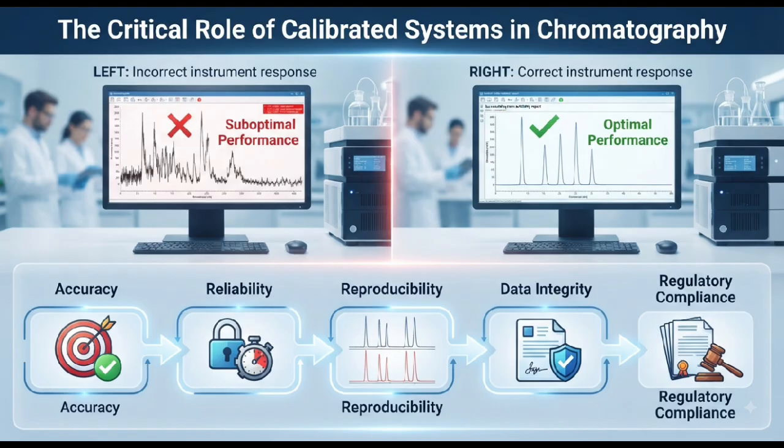Why HPLC calibration is important? Why is HPLC calibration important? Because analytical results generated by an HPLC are used for important pharmaceutical quality decisions.